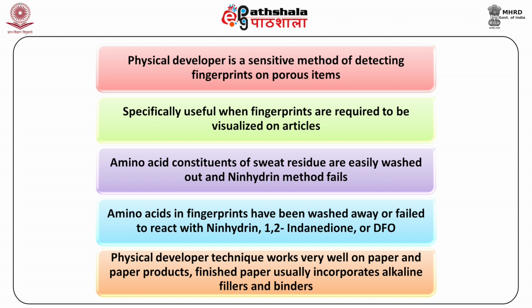Then, when the amino acids in fingerprints have been washed away or failed to react with ninhydrin, 1,2-indandione or DFO, processing with physical developer may still produce identifiable latents. However, physical developer is time consuming, expensive, destructive, and has a short shelf life.